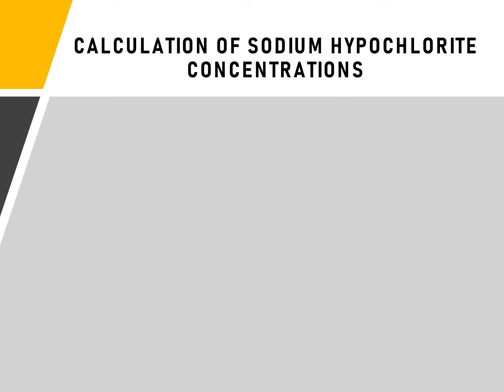Concentration may also vary according to the national regulations and the manufacturer's formulations. To achieve the desired concentration, it is necessary to prepare sodium hypochlorite by diluting the basic aqueous solution with a given proportion of clean, non-turbid water to produce the final desired concentration.